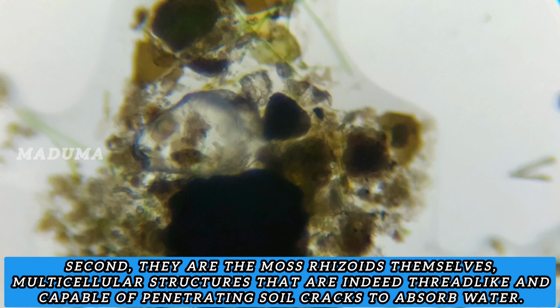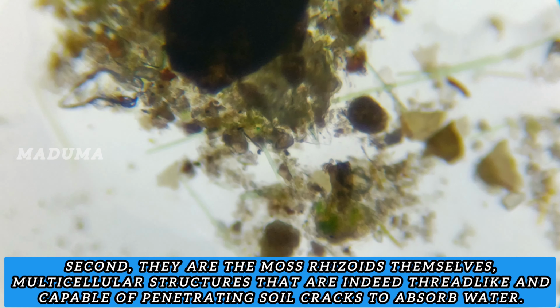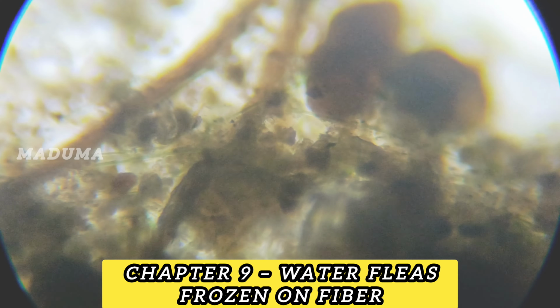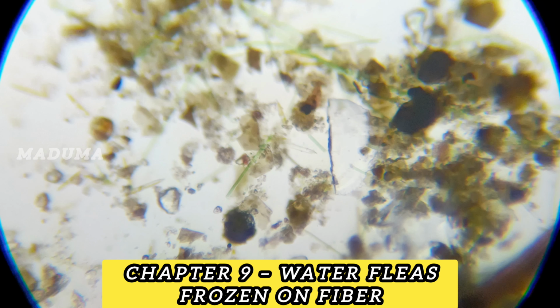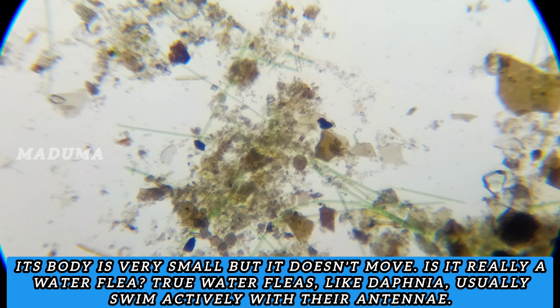Second, they are the moss rhizoids themselves, multicellular structures that are indeed thread-like and capable of penetrating soil cracks to absorb water. Chapter 9. Water fleas frozen on fiber. Its body is very small, but it doesn't move. Is it really a water flea?